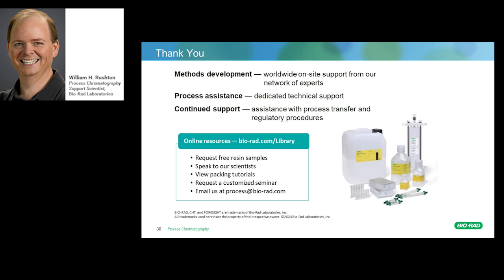The last question for the webcast is, my team and I would like help packing CHT. Do you offer training? Yes, we do offer training. I have gone throughout the U.S. and sometimes overseas to go on site to do training for customers to make sure that everything's going right, because CHT is a little unique because it is a non-compressible ceramic media.